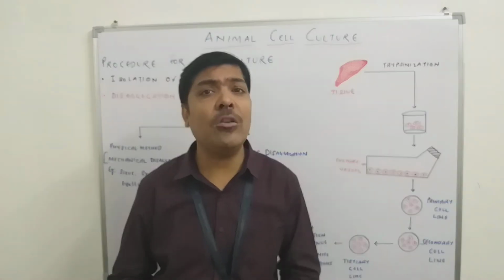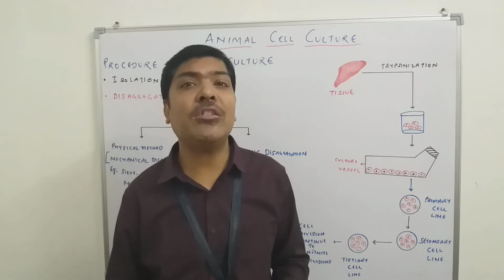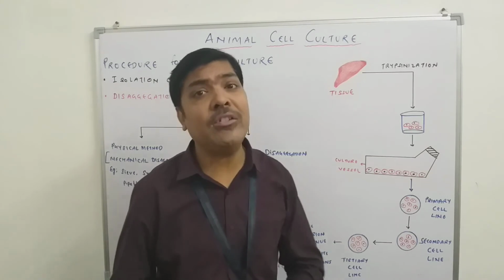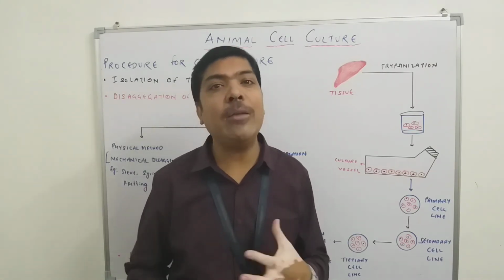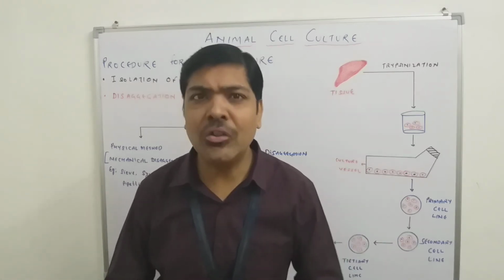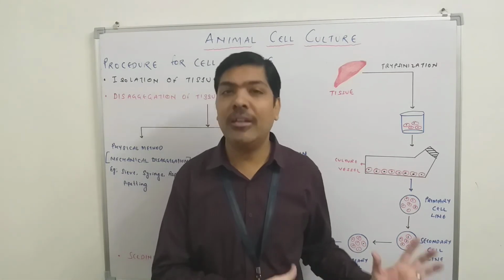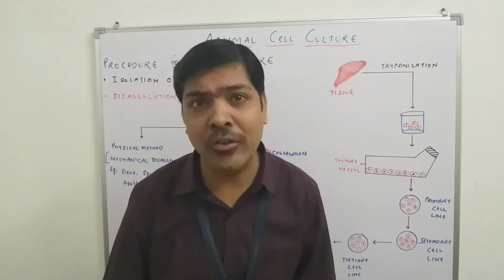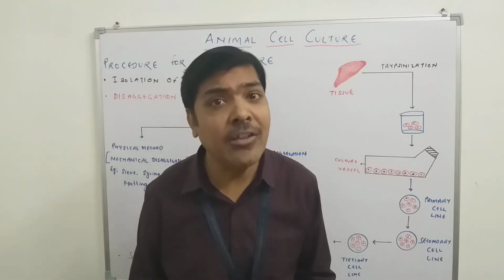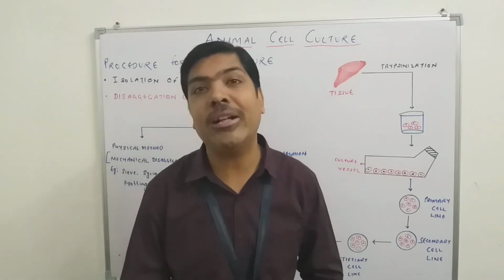The subculturing phenomenon, like we have discussed in microbiology, where we subculture the microbial cell, here also we have to go for repeated subculturing of the cell, so that every time we can maintain a very long-term continuous cell line. A very important technical term associated with subculturing in animal cell culture technology is called passaging. So we have to go for passage of the cells that are already cultivated in the culture vessel.